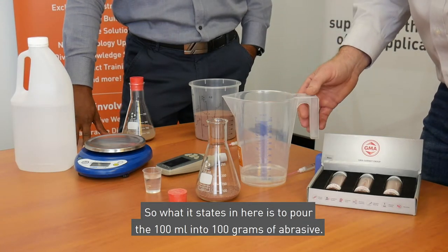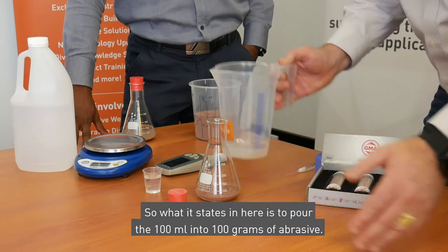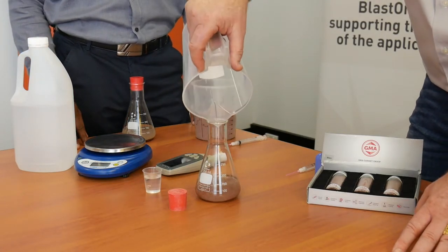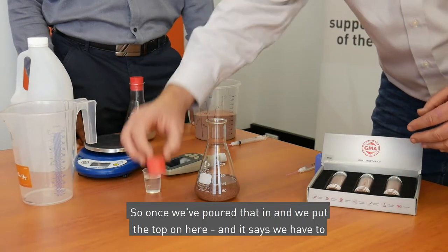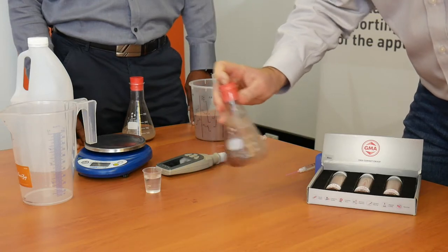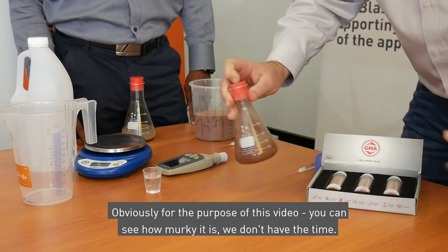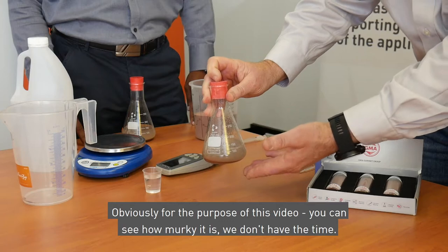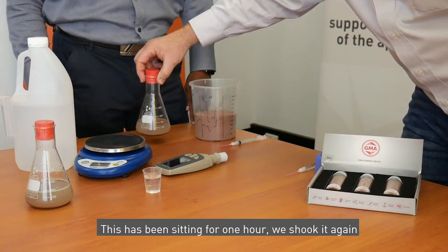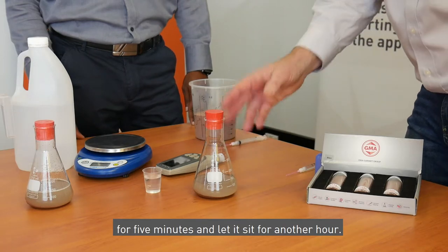The standard states to pour 100 ml into 100 grams of abrasive, so we're going to pour that in now. Once we pour that in and put the top on, it says we have to shake vigorously for five minutes. Once we've shaken this for five minutes we have to let it sit for one hour. For the purpose of this video you can see how murky it is — we don't have the time, so we're going to put that aside and here's one we prepared earlier. This has been sitting for one hour; we shook it again for five minutes and let it sit for another hour.